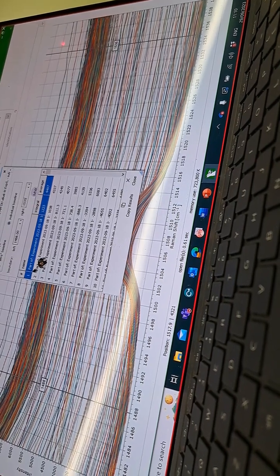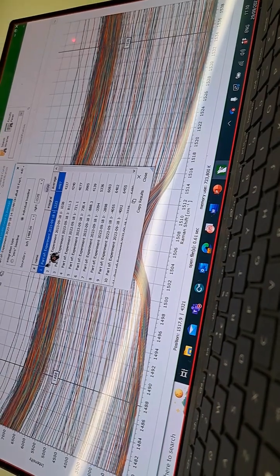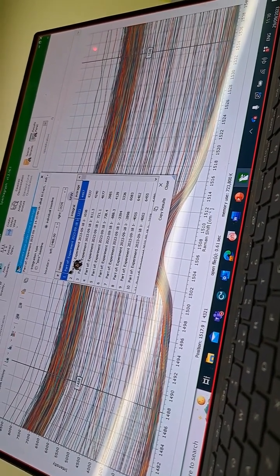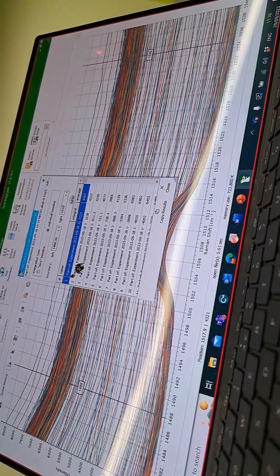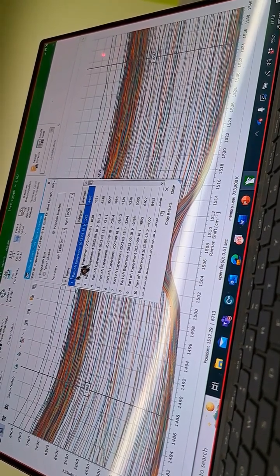It's two lines on the screen, those are the bounds. So it's applying a baseline to each one, in the area of the peak that's there. Okay.